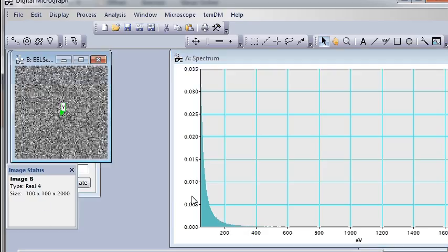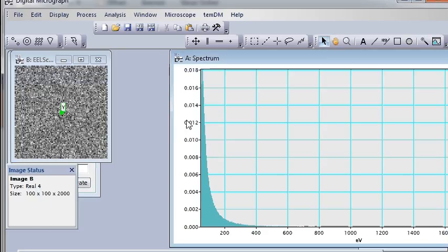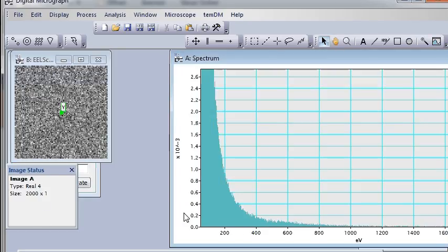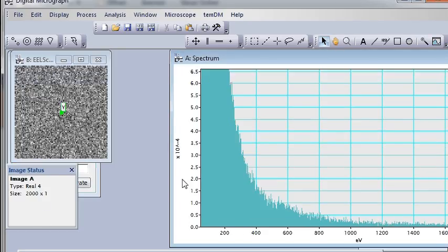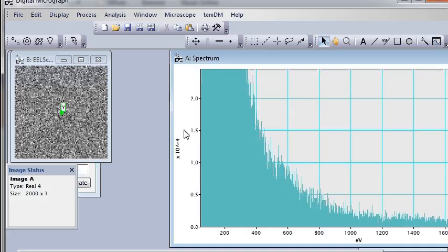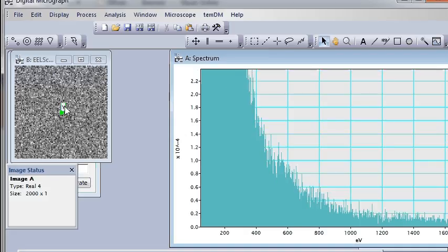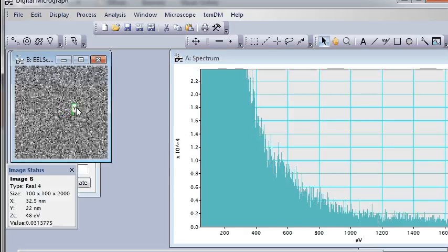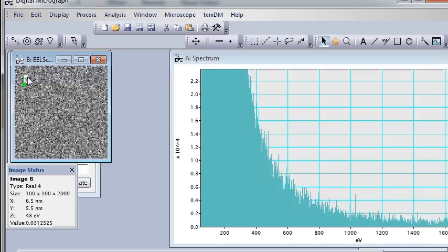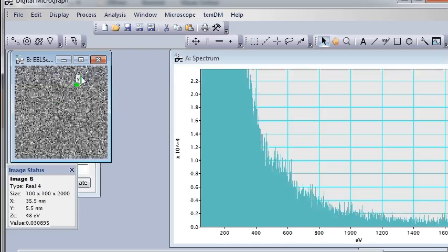And in an individual window we will see the spectrum. Now just drag your pointer across your spectrum image and the spectrum will change accordingly.